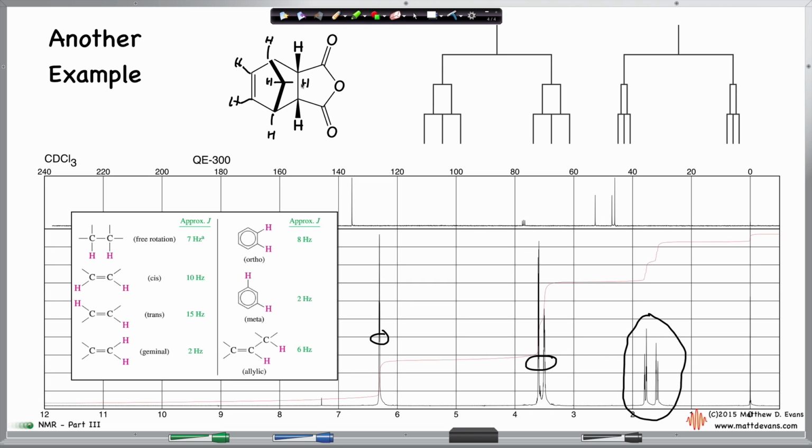When you have diastereotopic hydrogens, which you do at the very tippy top here, they couple to each other, as it turns out, because they're in different local magnetic environments. So only diastereotopic hydrogens have coupling constants between them, or at least ones you have to consider, and we do have to consider it. Okay, so these are coupled together, and in both these tree diagrams, the biggest gap right there, surprisingly enough, is the coupling of the two hydrogens that are diastereotopic. So that's the biggest gap in both of them. This gap right here and this gap right here are the same between them. There's no difference between them.